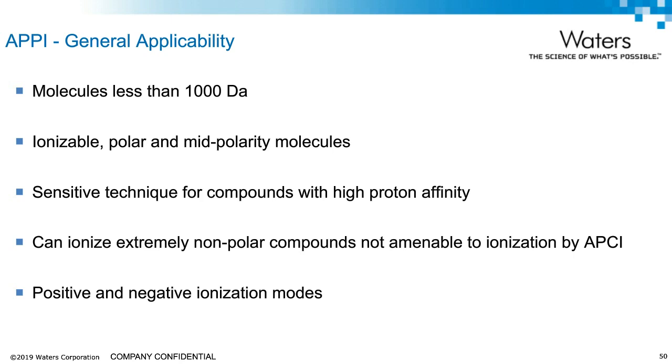It works well with polar molecules and is sensitive for compounds with a high proton affinity. It can also ionize very non-polar molecules such as the naphthalene we saw at the beginning of this webinar, and can ionize in both positive and negative modes.